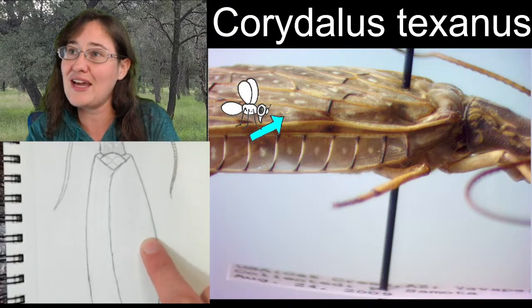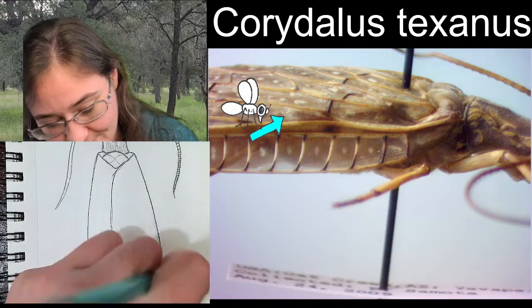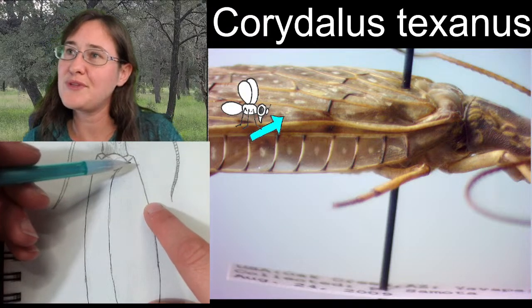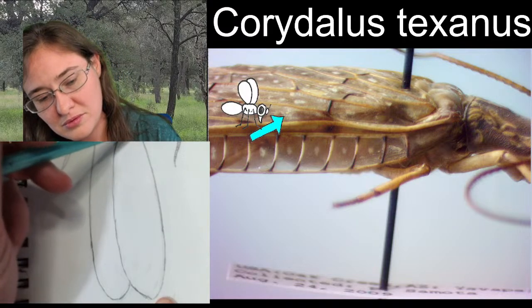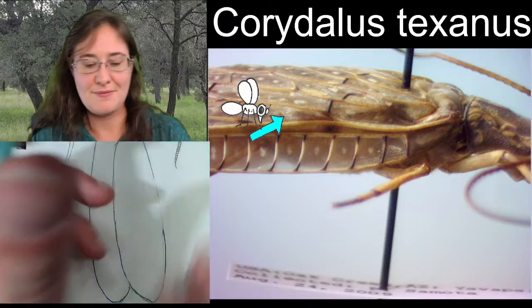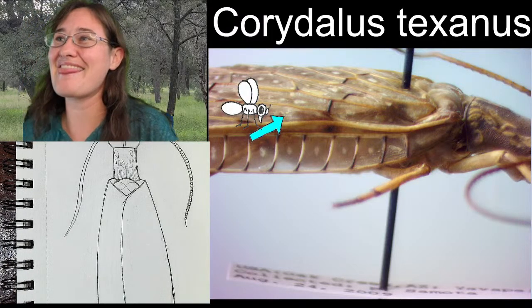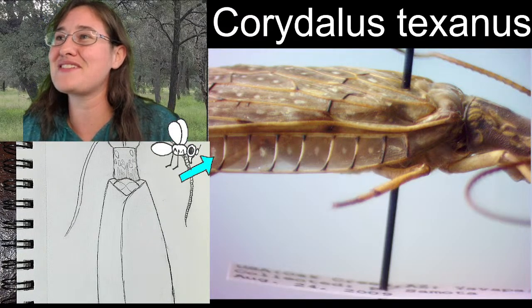And then it kind of is gonna, so I was thinking we're gonna have to fix this really quick because that folds down, but then eventually you can see it on the top. We're not going to play with that. Not today. Maybe another time. But for those of you, that's your description. And, fun thing, there's a white spot in the center of every single one of those cells.